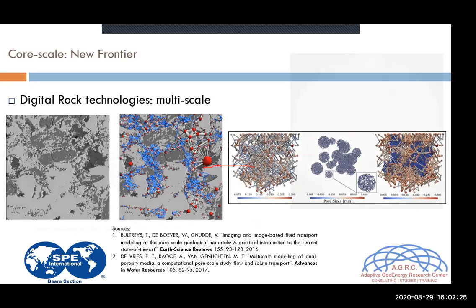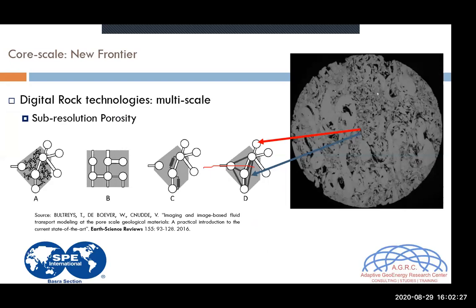Just to give you an overview of this, here, if you have a well-defined pore, let's say this here, and you have this unresolved region, a darker gray, where at this resolution you didn't capture the pore system, you can perform this kind of numerical or modeling analysis there, or you can perform this kind of high resolution analysis and try to correlate them.